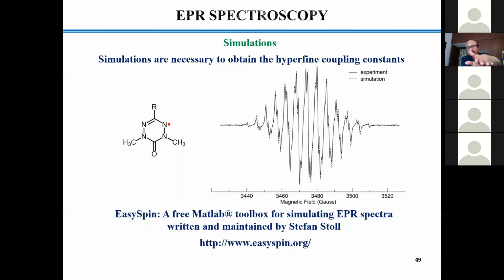If they don't synchronize on top of each other, then whatever parameters you get through computational processes, your reliability factor won't be very high. So you need to have 1:1 overlapping. And if you have that kind of spectrum, then any data you get out of your computational process is acceptable. People would accept you with a proper reliability factor.